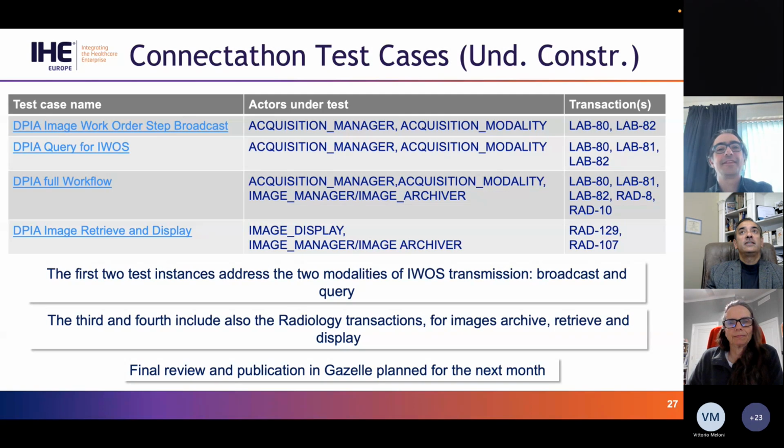And these are the Connectathon test cases that are currently under construction. We would welcome your participation in this. Still relatively basic, a kind of minimalistic, foundational number of data elements. I don't think it's anything too complicated. Most of the systems in the market would be able to support it. So please, again, come out, try to interact with other vendor systems, and see what you can do to help support this interoperability initiative.